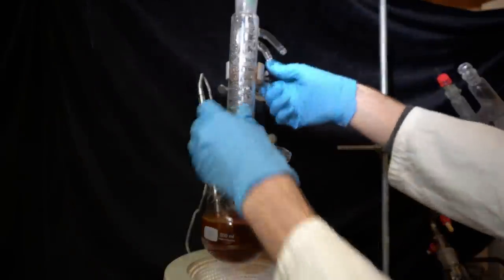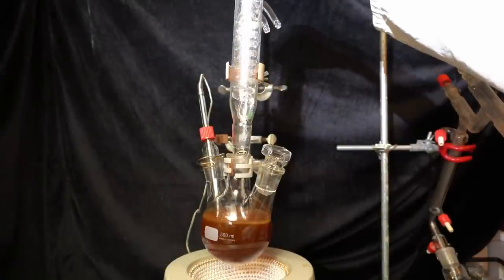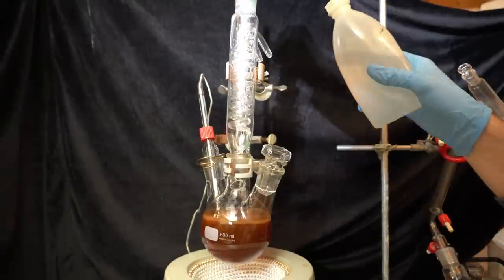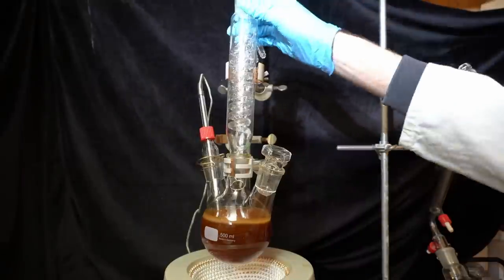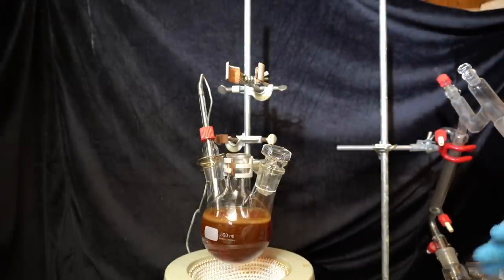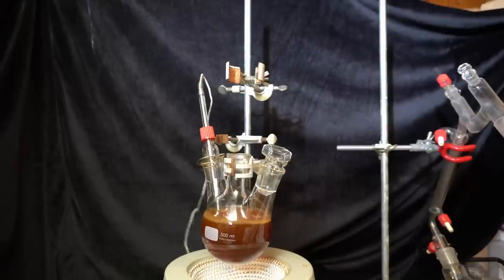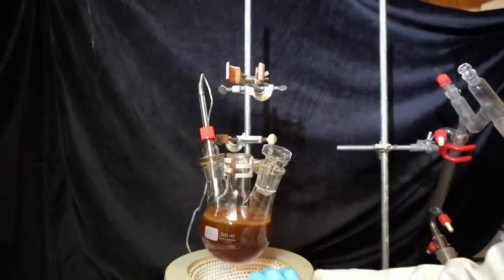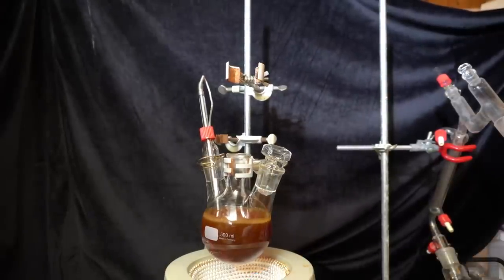To separate the dimethylaniline from the crude mixture, in the original paper they simply diluted the ethanolamine with water and then extracted the product. However, my glassware is simply too small to deal with the amounts of water this would require at my scale. I will therefore steam distill the dimethylaniline.